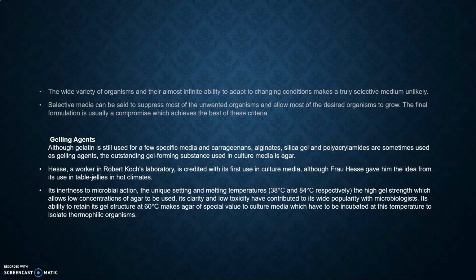A wide variety of organisms and their almost infinite ability to adapt to changing conditions makes a truly selective medium unlikely. The selective medium can be said to suppress most of the unwanted organisms, and it may allow most of the desired organisms to grow. Final formulation is usually a compromise which achieves the best of these criteria.